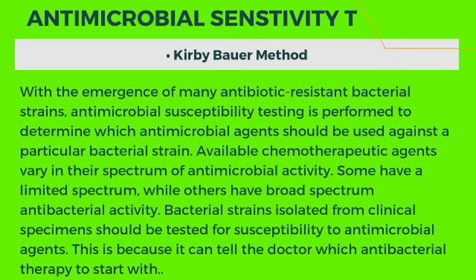Now next we will move on to the antimicrobial sensitivity test, which is the Kirby-Bauer method. With the emergence of many antibiotic resistant bacterial strains, antimicrobial susceptibility testing is performed to determine which antimicrobial agent should be used against a particular bacterial strain. Available chemotherapeutic agents vary in their spectrum of antimicrobial activity. Some have a limited spectrum, while others have a broad spectrum of antibacterial activity. Bacterial strains isolated from clinical specimens should be tested for susceptibility to antimicrobial agents. This is because it can tell the doctor which antibacterial therapy to start with.